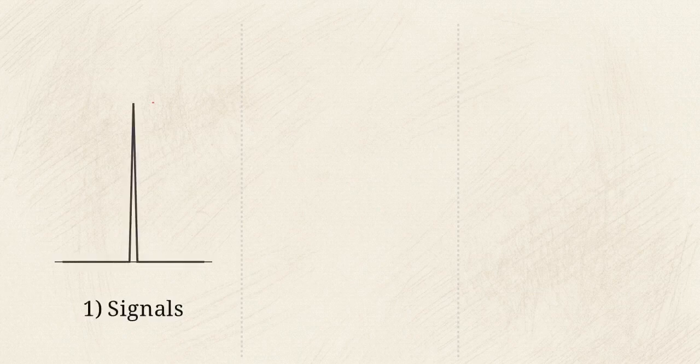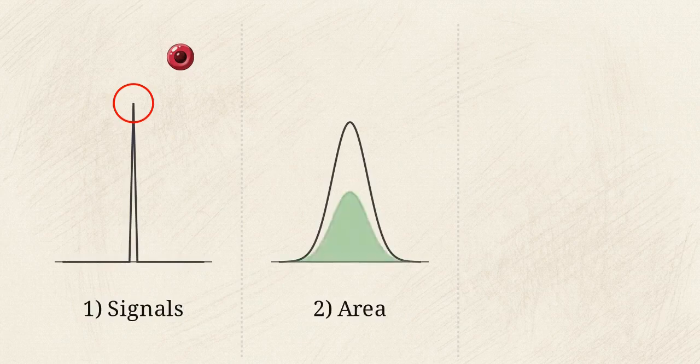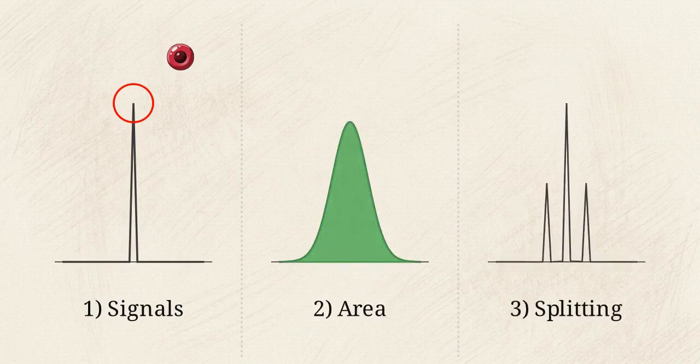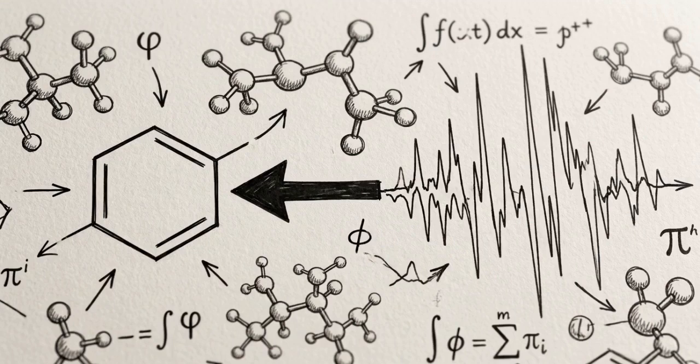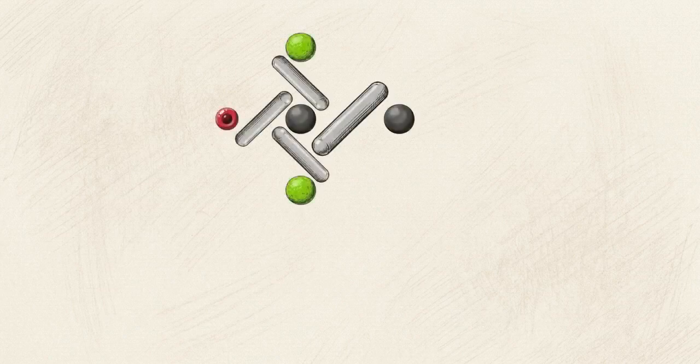These 3 criteria are chemical environments, which determine the number of signals, integration, which measures the area of each peak, and multiplicity, which describes how those peaks split. Applying these observations in a specific sequence provides a consistent way to work backward from a spectrum to a finished molecular structure. Consider 1,1,2 trichloroethane.